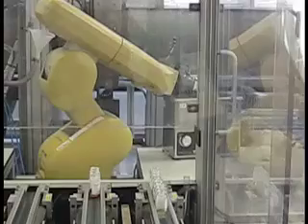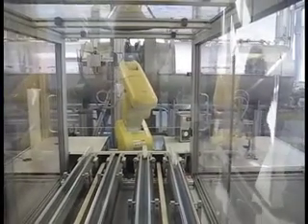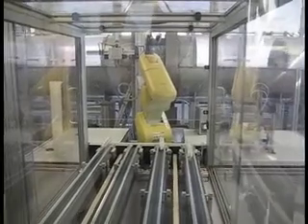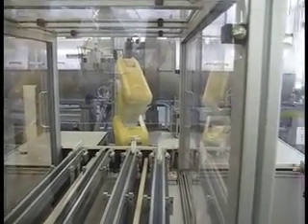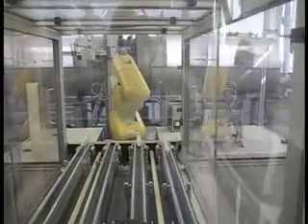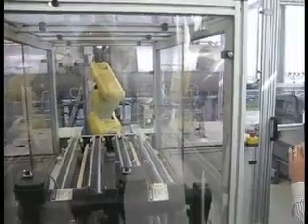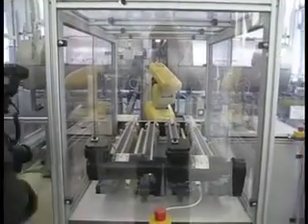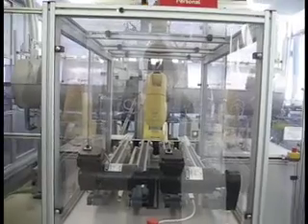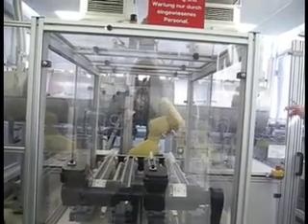So that, of course, is the problem with the concentration we're working at. Many things are not in fact a complete solution, but that is simply physical chemistry. If it could be correct, the volume is then, as you can see there, it's being sucked up. You can see the arm moving slowly. And then the next plants have been brought into position.